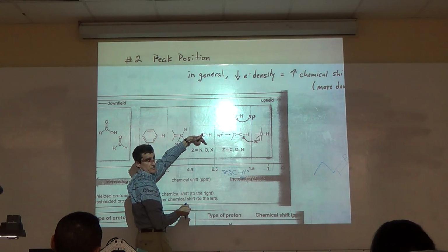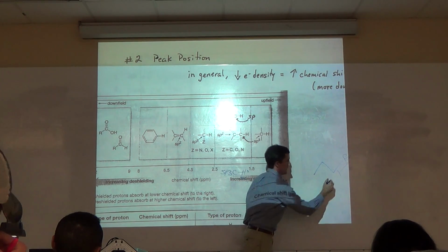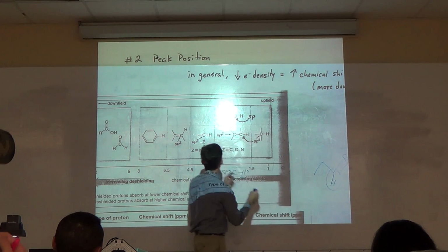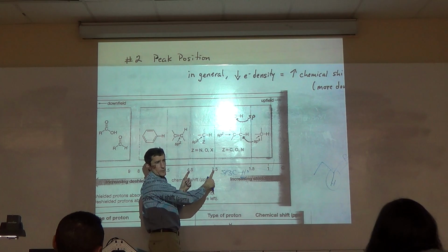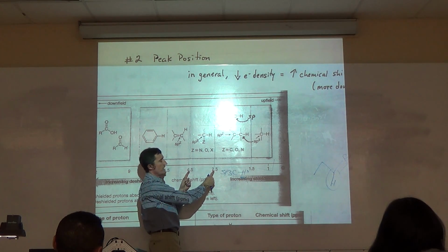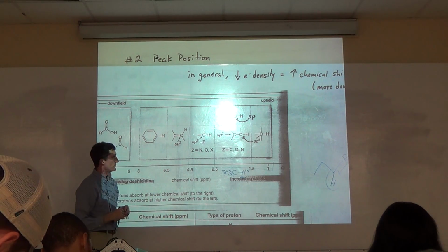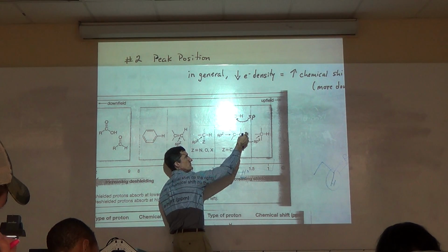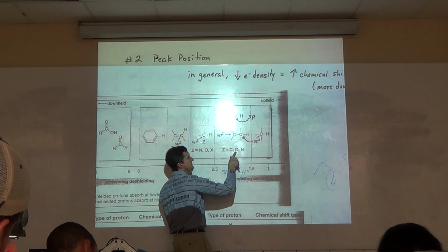The H can't be bonded to the halogen; the C is. That CH is about 3 to 4. They say 2.5 to 4.5, more downfield. What's in between? A CH where the carbon is bonded to a carbonyl, where Z is oxygen, is most common.